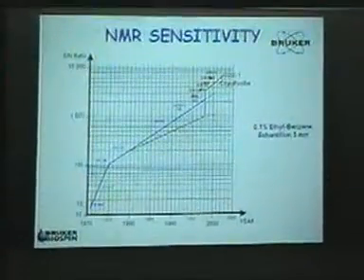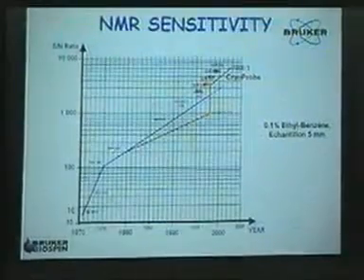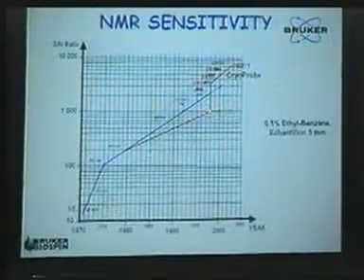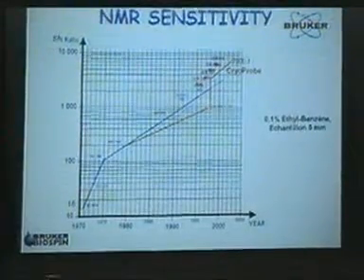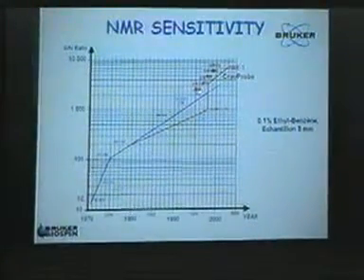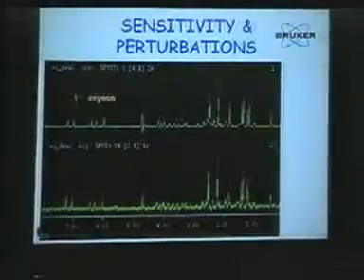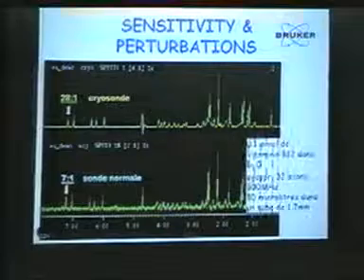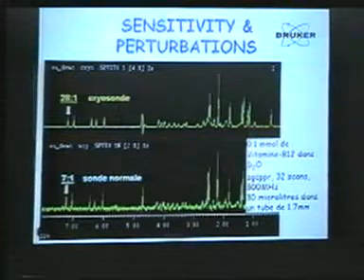And this summarizes well the picture. You see now why you have not only a better signal to noise due to the NMR spectrometer, but also this quantum jump due to the cryoprobes. Next. However, this is all nice, but everything is not always as nice as it looks.